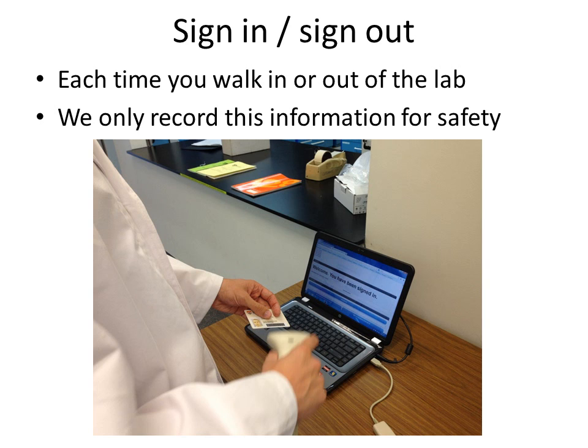One aspect of safety is that we need to keep track of who is in the lab at all times in case of an evacuation. We're doing this by having a sign-in, sign-out computer where you scan your student cards each time you walk in or out of the lab. You must do this even if you're just going out to the toilets or to have a drink of water. The computer will record your attendance at the lab, but we will not record any other information. This is simply being collected for safety purposes. If you don't have your student card with you, you can type in your SID.